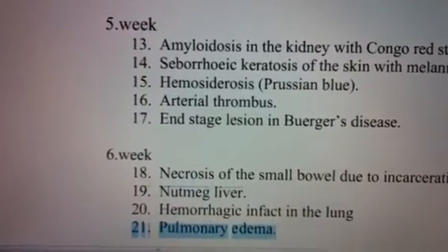I'm guessing it's a transudate because it looks not so blue. As far as I understood, protein is supposed to look kind of blue. So this is the alveoli, and this is the edema. I don't want to say anything else here. That was the pulmonary edema.